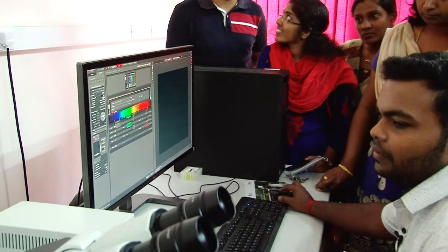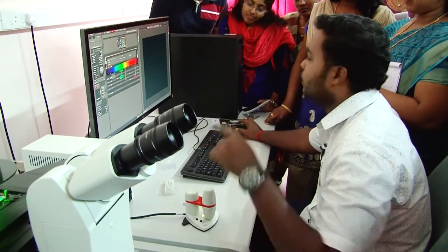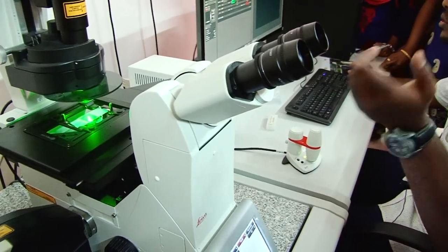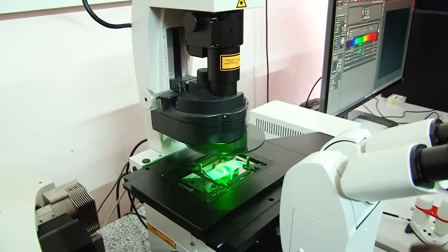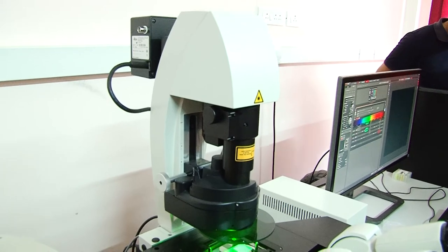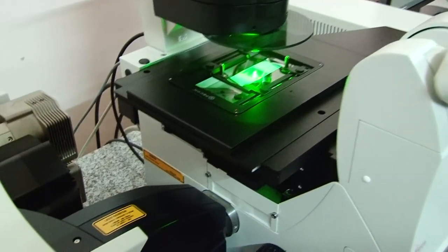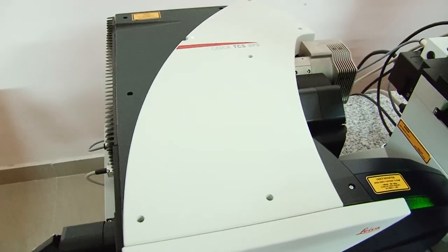Otherwise, primarily we do one thing, because we have this bright field and camera. First we use the bright field to focus the image on this camera directly. Otherwise, we can use this objective also. I already told that we have 10, 20, 40, 63 and 100 objectives. 10 and 20 are dry, and the others are oil immersion mode. We currently can't do it in oil mode because the environment is so dusty. So we are currently using 10, and it is a standard sample. You are familiar with this one.